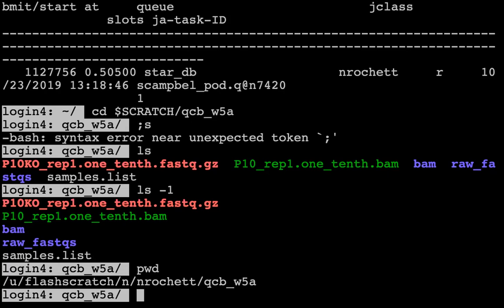If you have to download them, it's just going to take less time. So yeah, these are new files. Copy them to your Scratch directories.